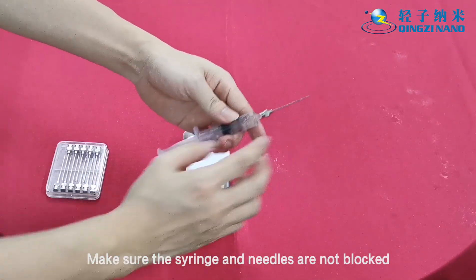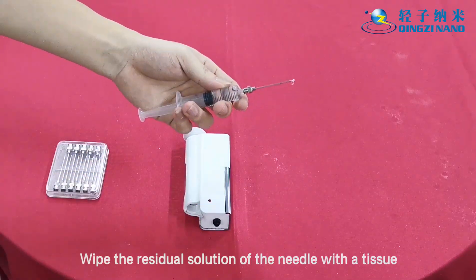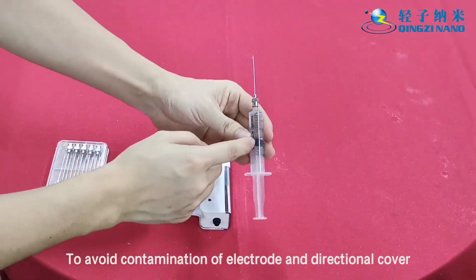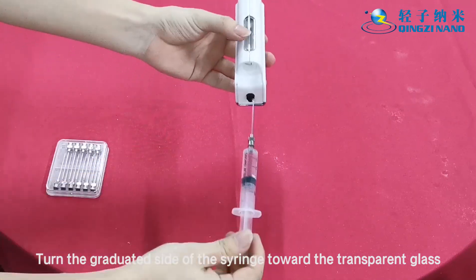Before use, make sure the syringe and needles are not blocked. Wipe any residual solution off the needle with a tissue to avoid contamination of the electrode and directional cover. Then turn the graduated side of the syringe toward the transparent glass.